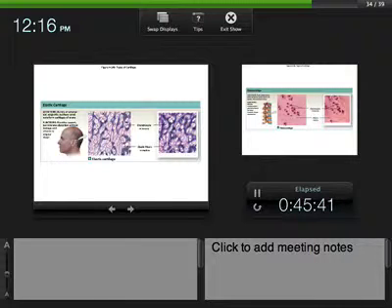And so when we look at this cartilage, there's much more elastic fibers in this, and it's not as dense with the collagen as you would have seen in the hyaline cartilage. Very stretchy, very deformable type of cartilage. Still have the chondrocytes in the lacuna, but this is not as rigid as the hyaline cartilage.